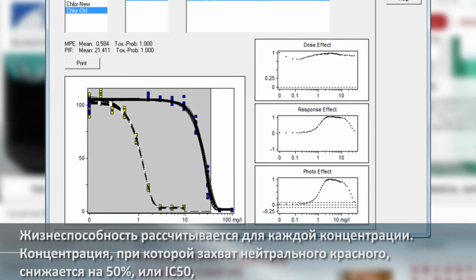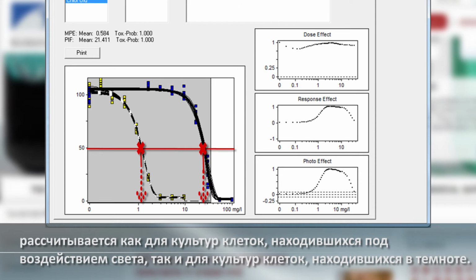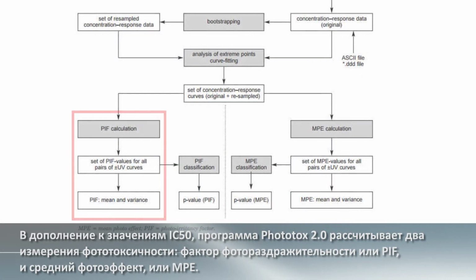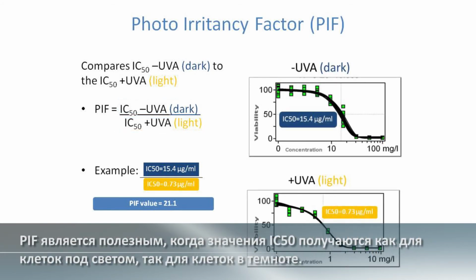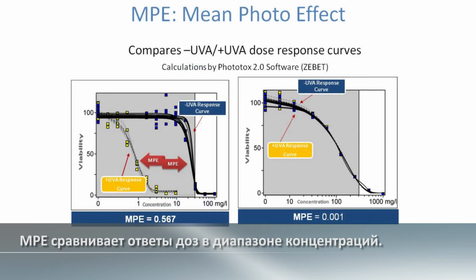The concentration where the neutral-red uptake is inhibited by 50%, or IC50, is calculated for both the light-exposed cell cultures and dark-exposed cell cultures. In addition to IC50 values, the Phototox 2.0 program calculates two measures of phototoxicity: the photoirritancy factor, or PIF, and the mean photo effect, or MPE. The PIF is determined by comparing the IC50 values of the cells exposed in the presence of light as compared to the cells exposed in the absence of light. The PIF is useful when IC50 values are obtained from both the light and dark exposed cells. The MPE compares the dose responses over a range of concentrations.